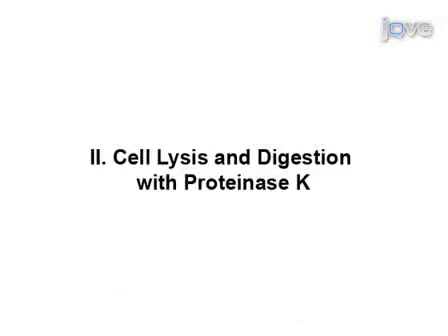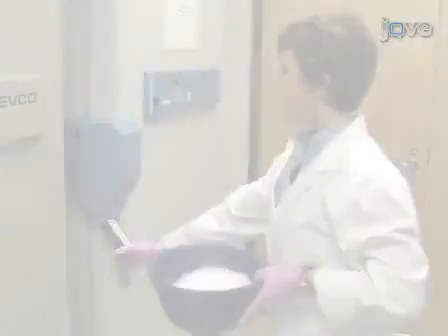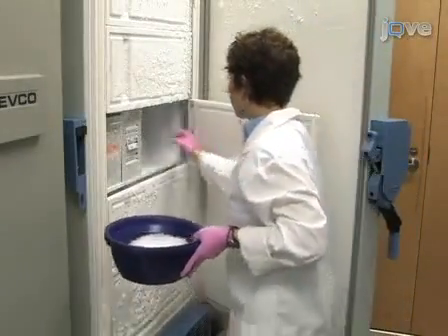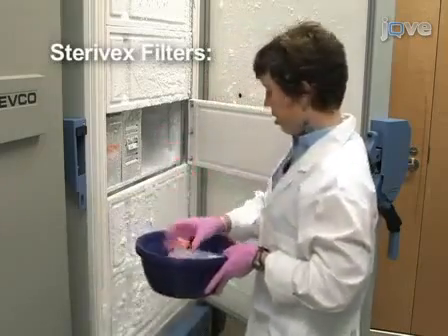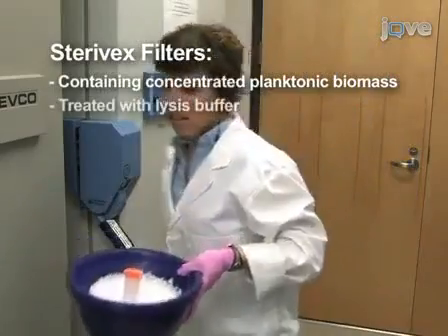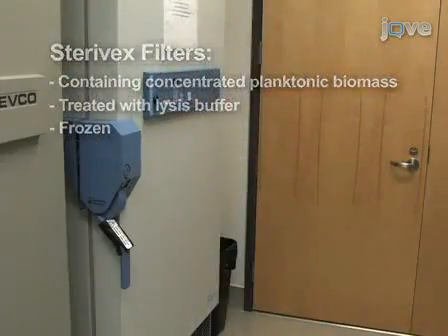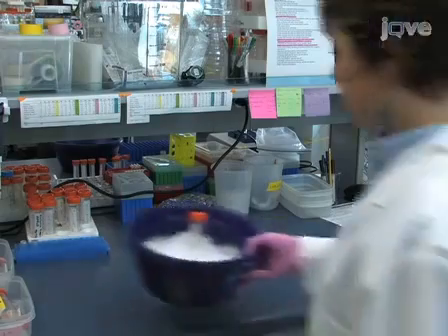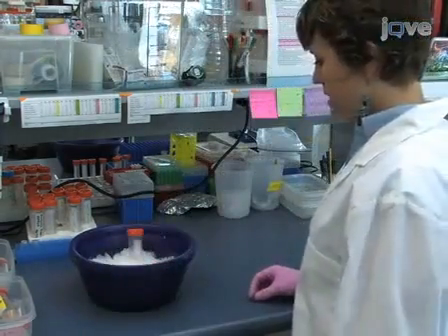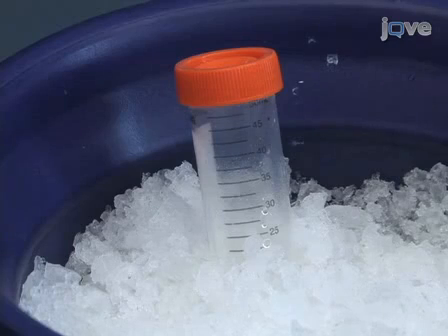So let's get started. Begin this protocol by thawing, on ice, the Sterivex filters that you have previously concentrated with planktonic biomass, treated with lysis buffer, and frozen. For simplicity, here we describe the procedure for processing an individual filter. In practice, we recommend processing 15 or fewer filters at a time.